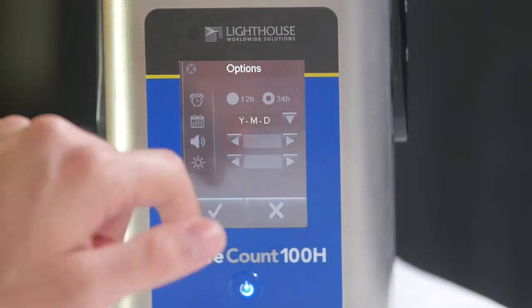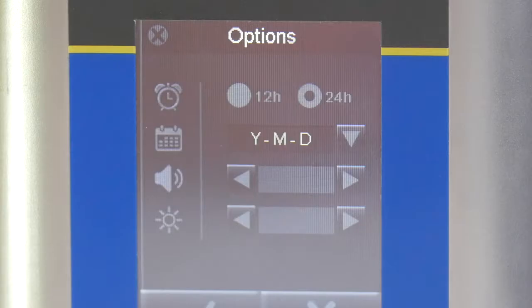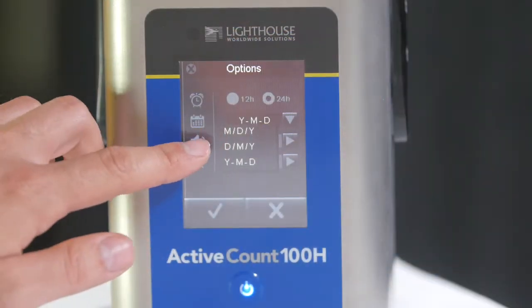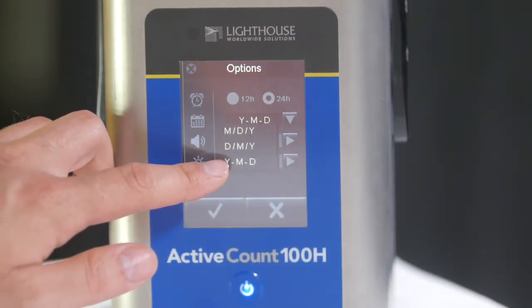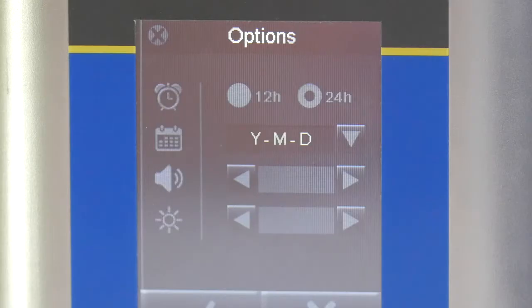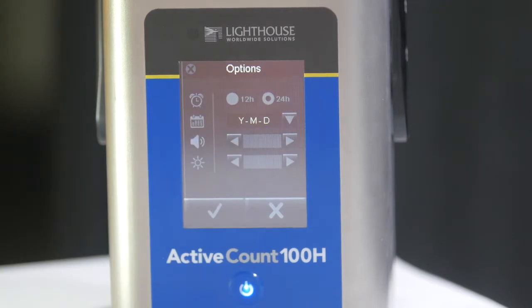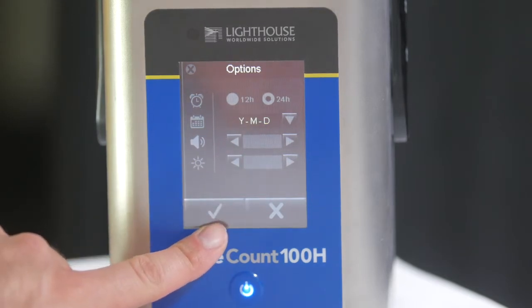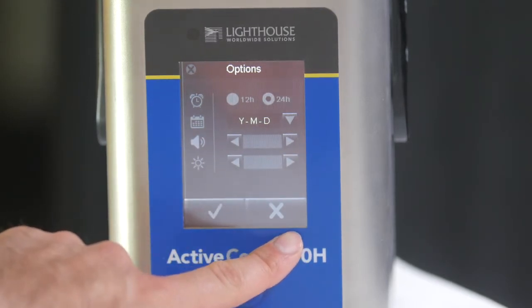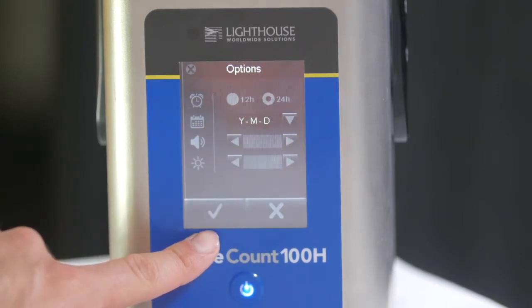Next, on the settings menu, we have additional options. The options include the time format, which can be 12 hours or 24 hours. The date format, which can be month/day/year, day/month/year, or year/month/day. We also have adjustments for the speaker volume and the screen brightness. Simply press on the left and right arrows to increase or decrease the speaker volume and screen brightness. To save the changes, we press the checkmark button, or to cancel, we press the X button. Let's save these changes and return back to the settings menu.